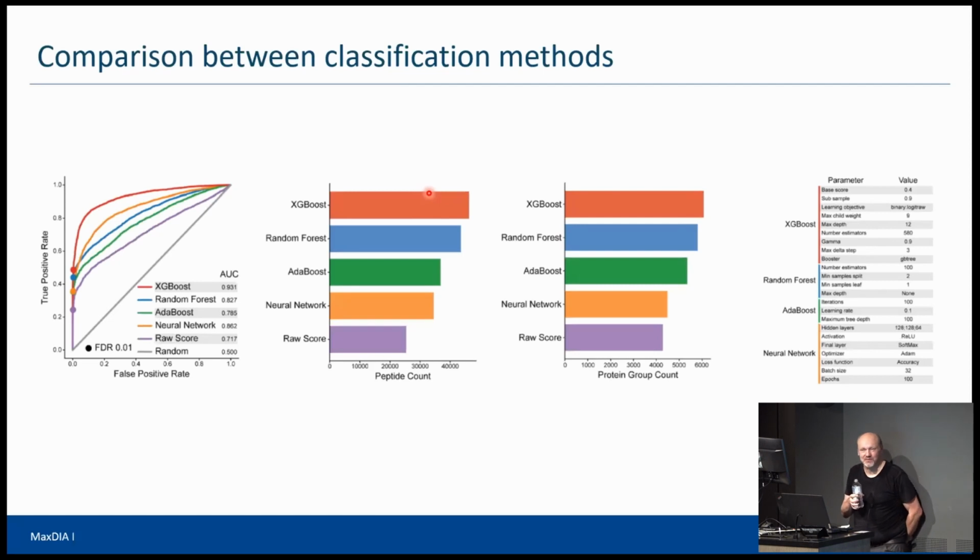So you also have to do something to the precursor properties. What you want is that the decoys follow the same distribution in terms of mass, retention time, and ion mobility. That's actually very crucial. Otherwise, you could just distinguish target and decoy by looking at the multivariate distribution of these values. And that's exactly what we do.